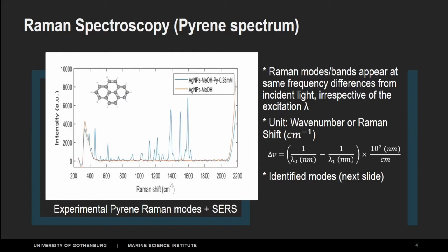And while we look at these specific numbers, it's because we call them as well the biological window. So the molecules that we are interested in, they give us a signature in this window from 200 to about 2200 wave numbers.